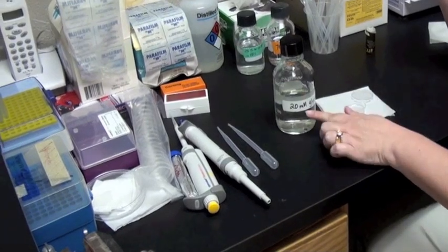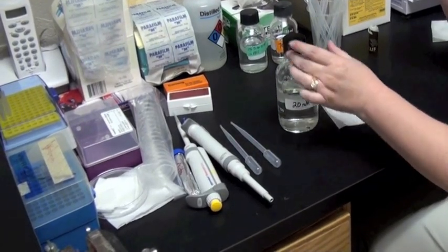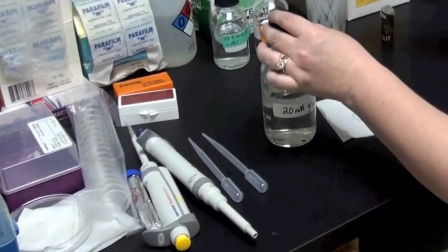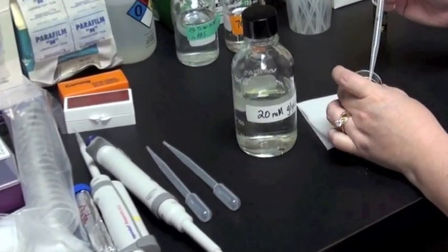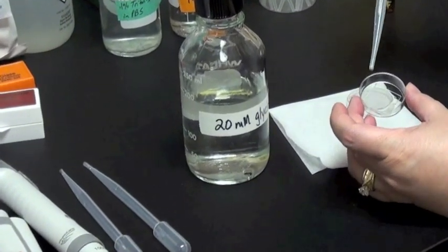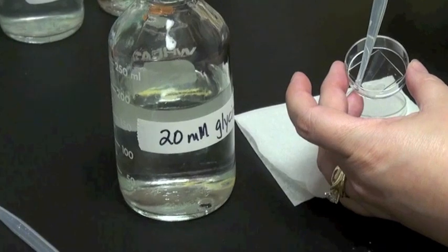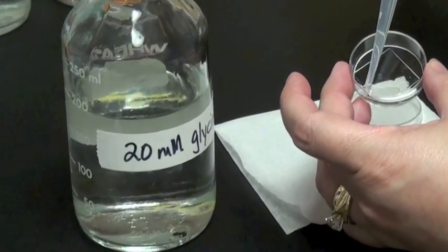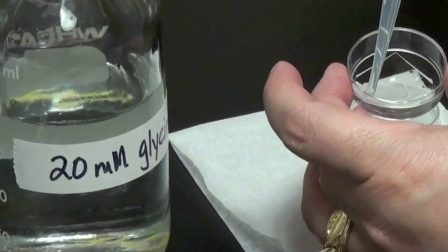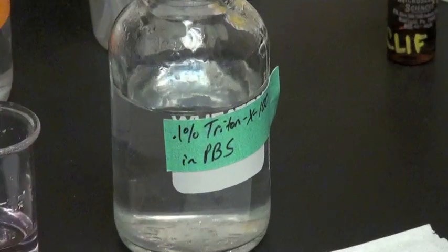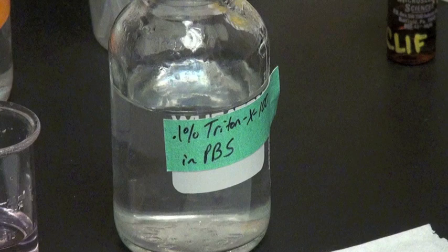Again, because I used an aldehyde fixation process, the lipids of my sample are intact. I want to use my sample for staining later, and in order to get the stains inside of my cell or tissue, I'm going to have to create holes in the membrane. One good way to do this is with a detergent. There are different types of detergents that you can use including Triton X-100 or saponin.